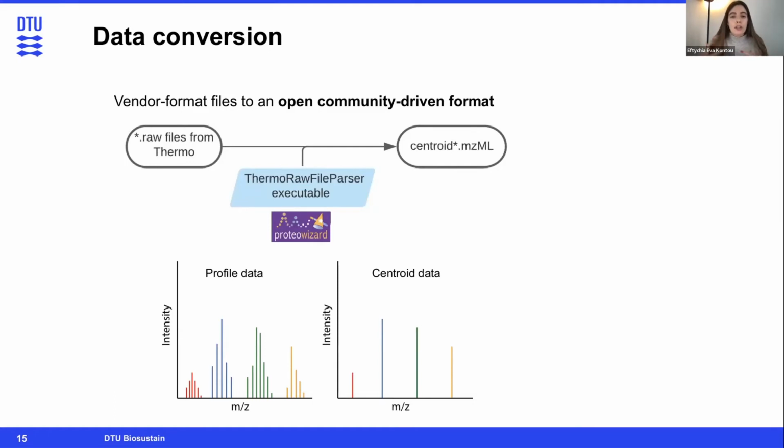So it will not always measure the exact same mass to charge. It will shift a little bit. So centroiding your data allows you to reduce the information and only keep the local maximum of each range of each metabolite. That helps a lot, making things less computationally expensive for the following algorithms.